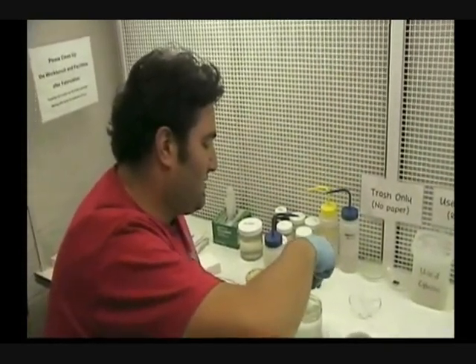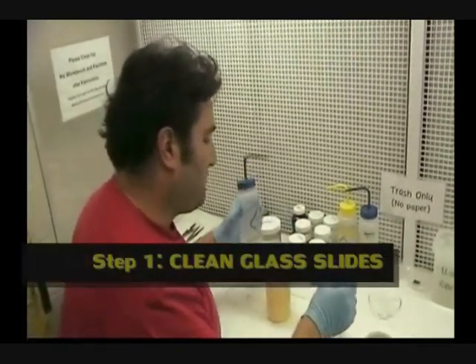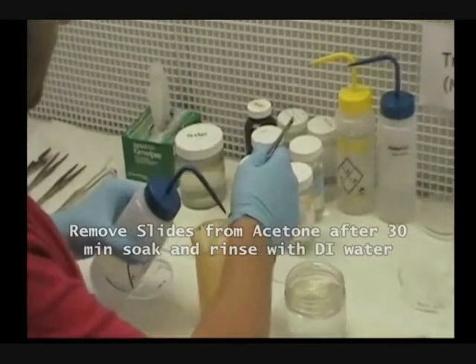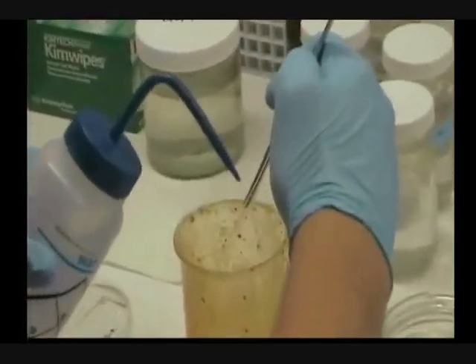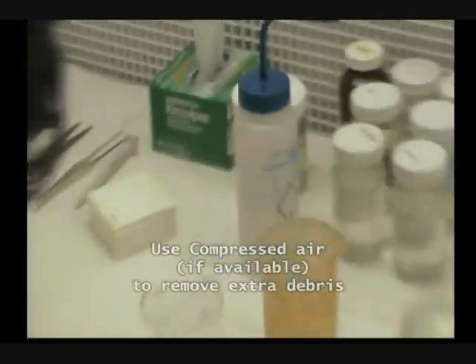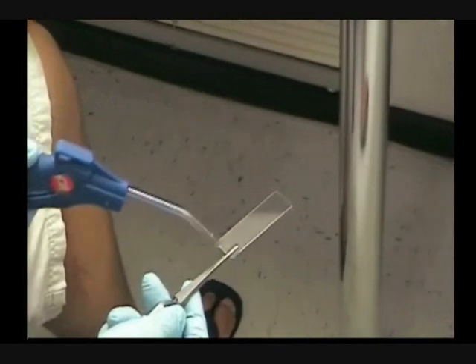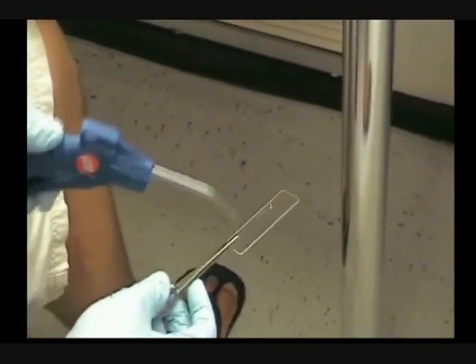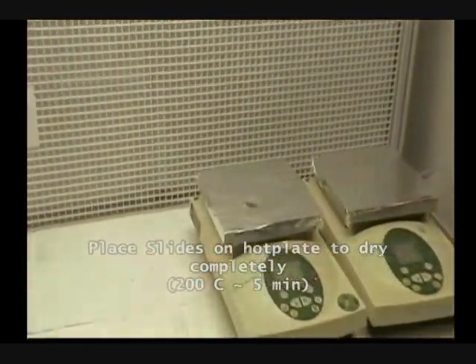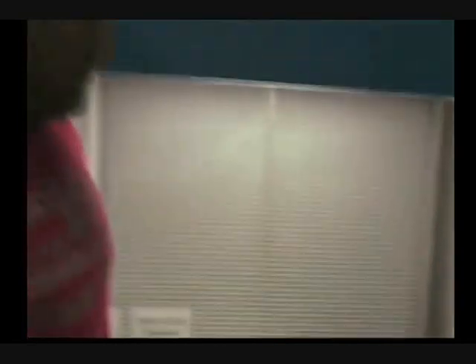Now we are going to demonstrate how to manufacture a lab-on-a-chip device by using soft lithography. The first step is to take clean glass slides, which have been soaking in acetone for more than one day, and then clean them with DI water. We place a clean glass slide on the hot plate for dehydration, and we have been waiting for 5 to 10 minutes to dehydrate the fluids.